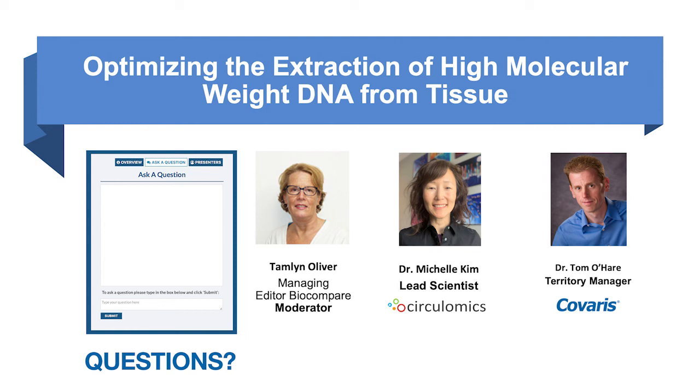And while there is some degradation to those tissues that are decade old, in-house on the tissues that we use for R&D, some of them go through a couple of freeze thaws. They've been cryoprepped. They're stored as powder. They're stored in the original tissue form. I don't see an appreciable degradation to the DNA that you extract from that, because the cryoPREP just changes the form of the tissue. So instead of being solid, it's in a powder.